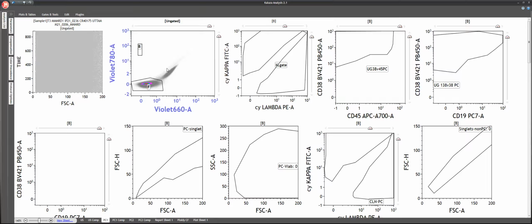For that, we look for mast cells or precursor B cells, that is hematogones, and CD117 positive precursor cells, which predominantly include myeloblasts, promyelocytes, and early precursor erythroid cells. So these are the three parameters which we can usually use for the representation of bone marrow.